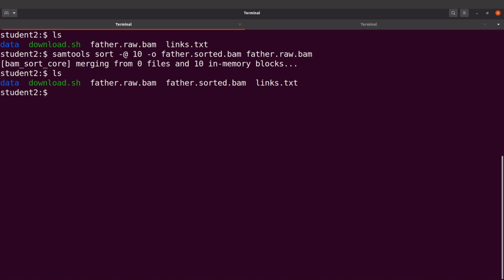Okay, so let's proceed. What we've done so far is not elegant. If you have lots of samples, it can be problematic. The first thing is, these BAM files, we need to put them in another directory so that we are able to better organize them and avoid accidentally modifying them. First, we should have done that immediately after generating them, but I'm just using it to explain why it's important to do some of these things.